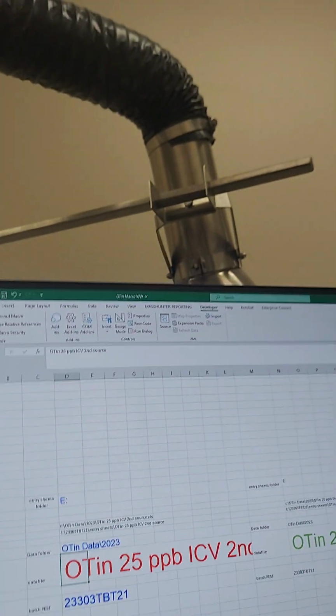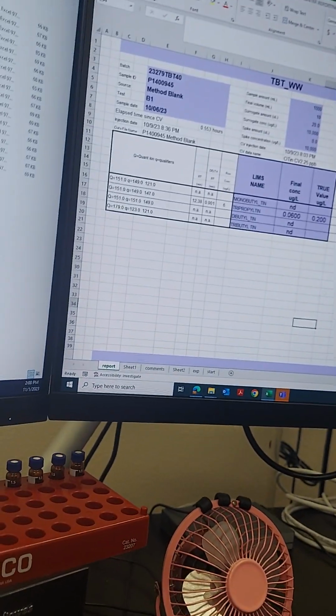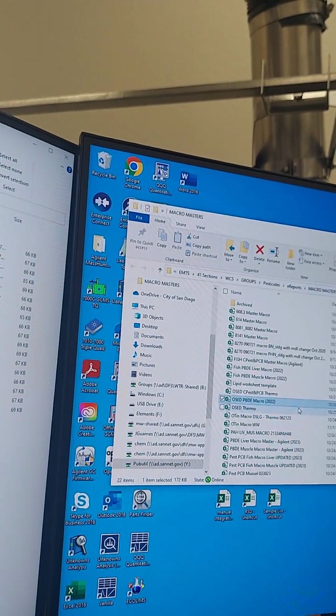Okay. So let's save it. Let's go back. So that's the pesticides, e-report, macromasters.